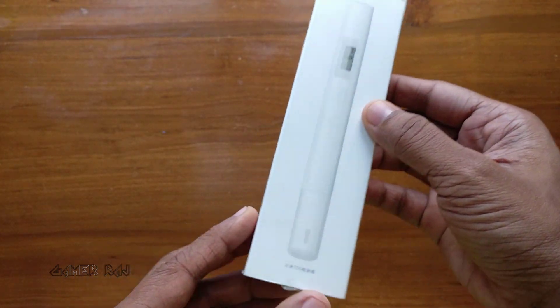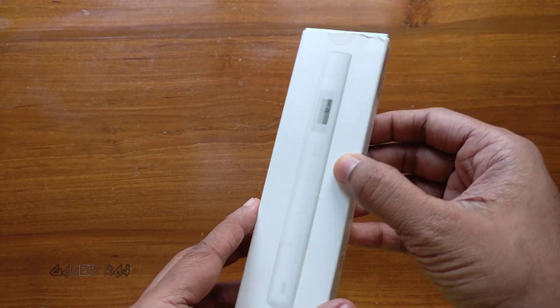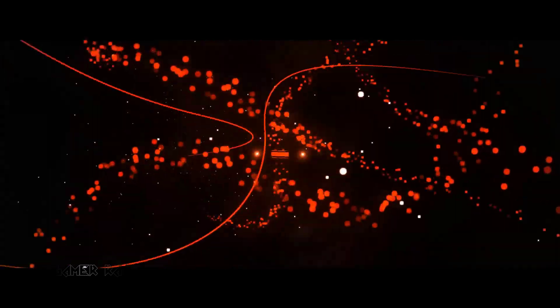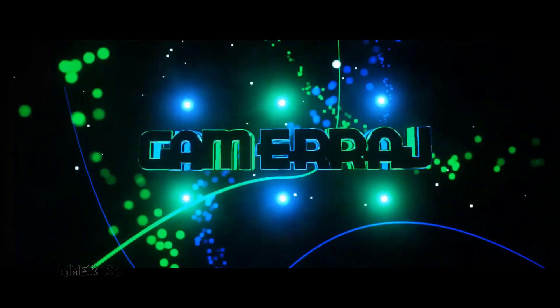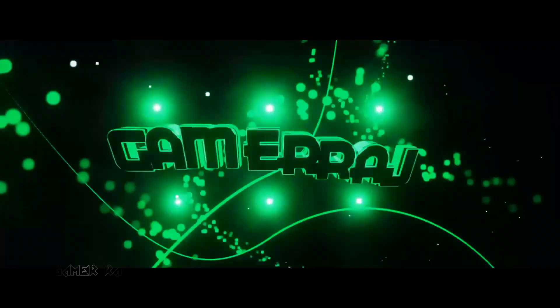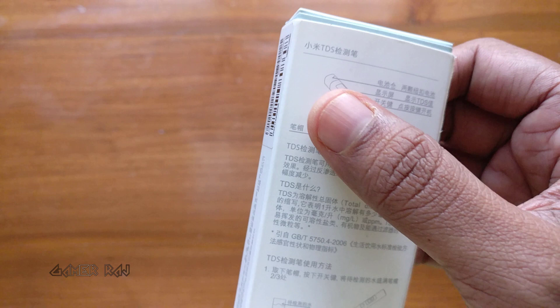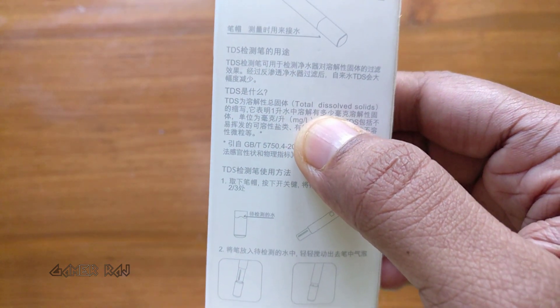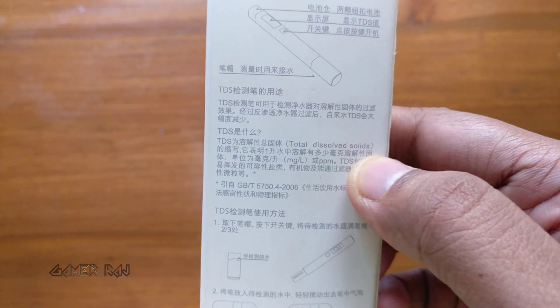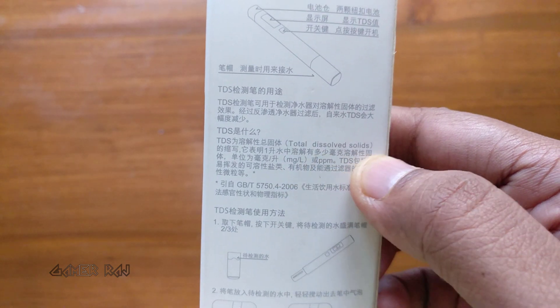Hello friends, it's Raj and this is the Xiaomi water tester. It estimates the TDS — that is total dissolved solids — in a solution as parts per million by measuring its electrical conductivity.